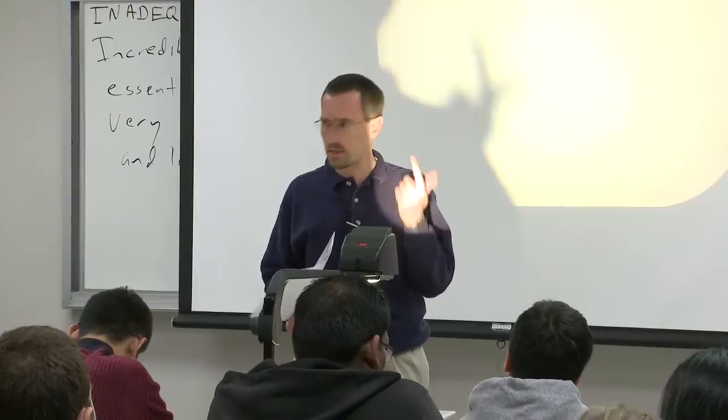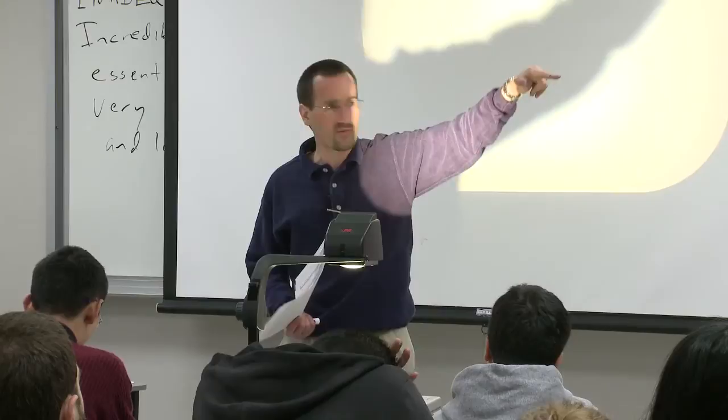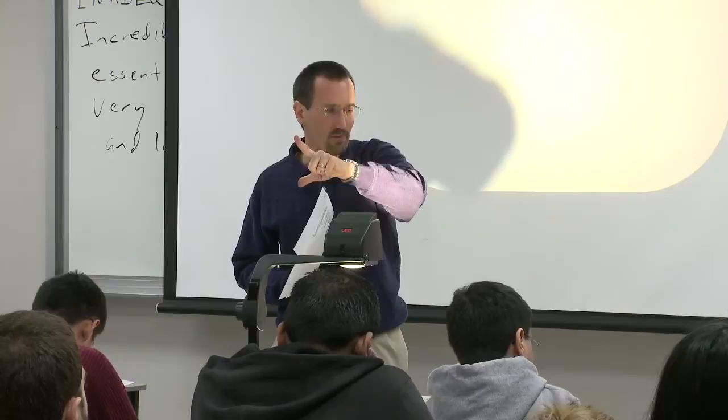So if I had a five carbon, just a linear chain with an isopropyl group at the end and a stereocenter way off five carbons away, chances are those two methyls would show up at the same position. But if it was just a couple of carbons away, probably at least in the carbon NMR, which is more sensitive, they'd show up at different positions.